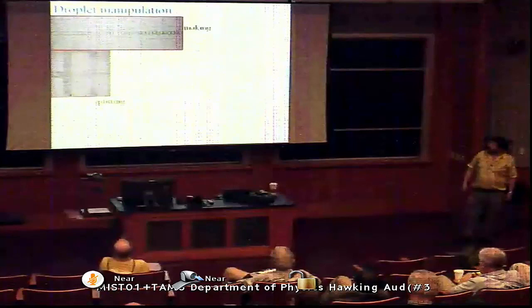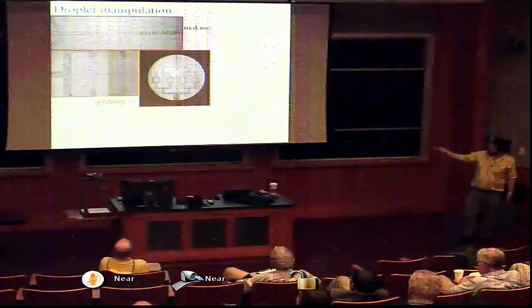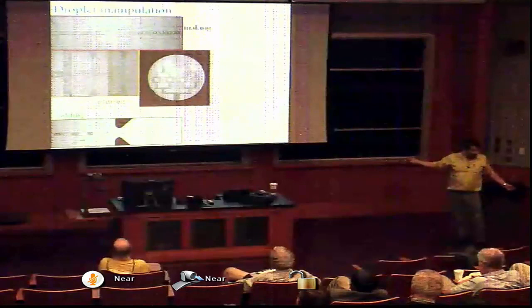So let me just start this more carefully. We make drops here. We learn how to break drops into 2 so we can do 2 experiments on them, 2 different sizes. We can break them many times. These are just different devices that we've made over the years. We can combine them. This turns out to be a very difficult thing to do. You need to do this because you have reactant A, reactant B, and you want to start a reaction. Remember, these are water drops, mainly going to be used for biology, water drops in oil.